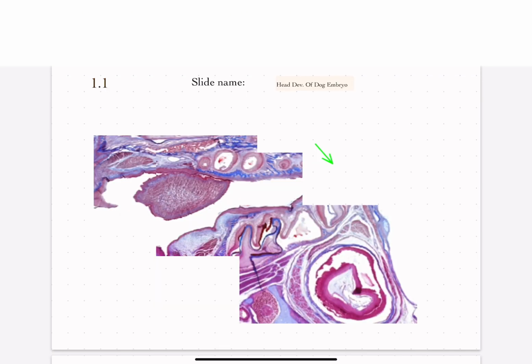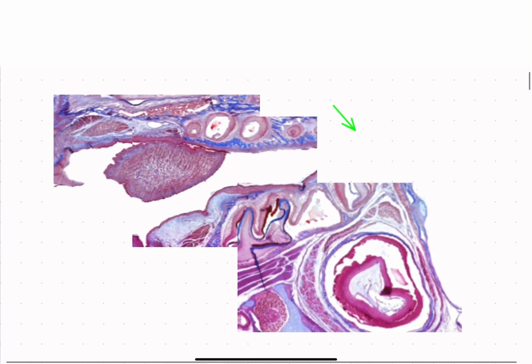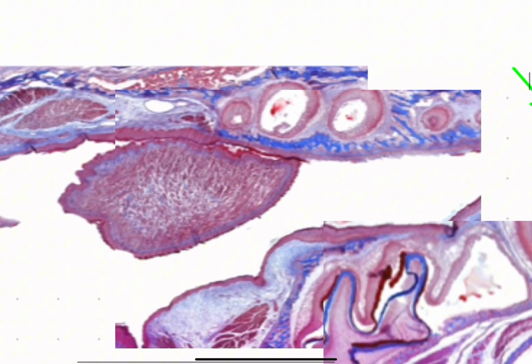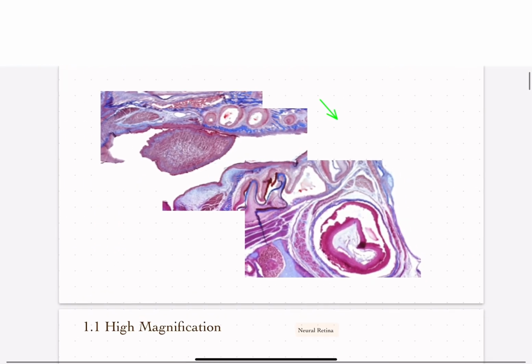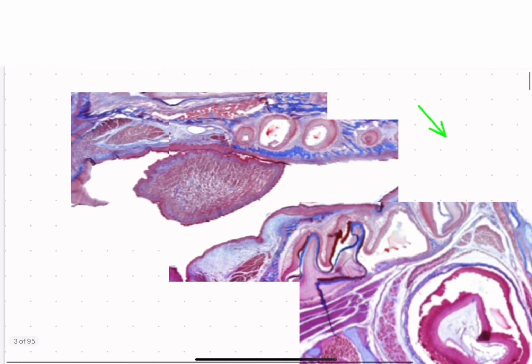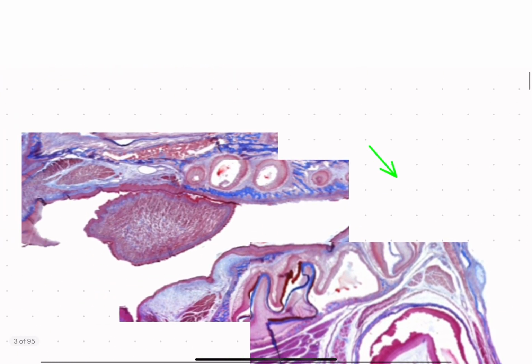Now we're going through all of these structures more in detail and in depth to show you which symbols, signifiers, and what other structures you have to look out for that I didn't include or did include in this specific test. Now, number one, this is a slide that we actually have in e-studies. It's just upside down and segmented because sometimes you won't get to see the entire slide, but more often than not they'll actually show you the entire head in smaller sections, but these are the most important part for me.